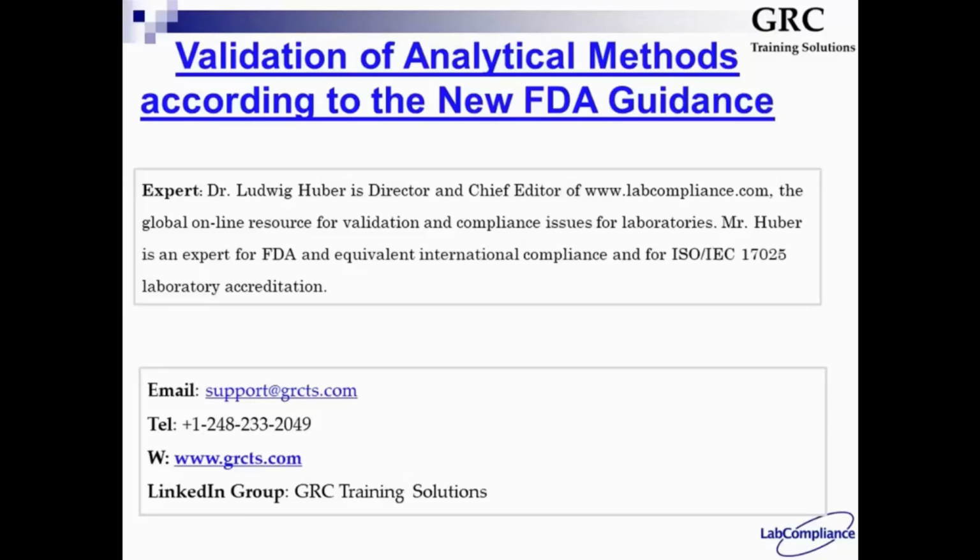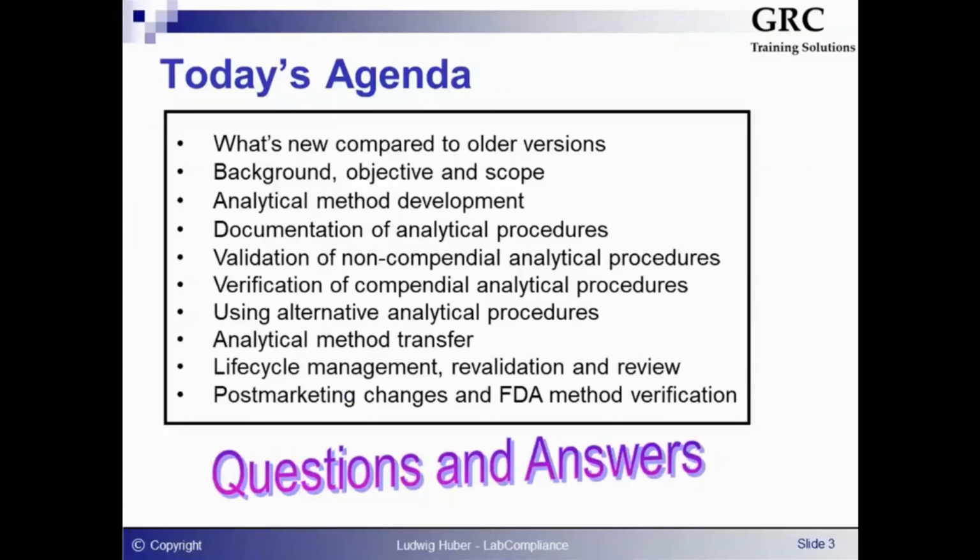Thank you very much, Alvin, for introducing me, and thanks everybody for joining us today for this presentation, which is on validation of analytical methods and procedures. We will talk about a relatively new FDA guidance document that came out back in 2015, but it's a very important time because at this point FDA is just starting to enforce this guidance document. So it's a very good idea to listen to my presentation. Okay, so I will now continue, and this is the agenda for today.